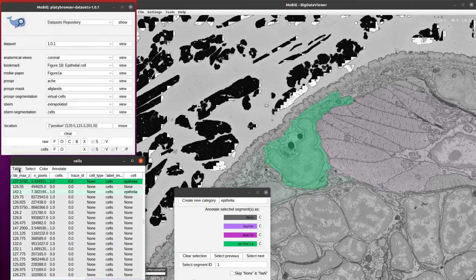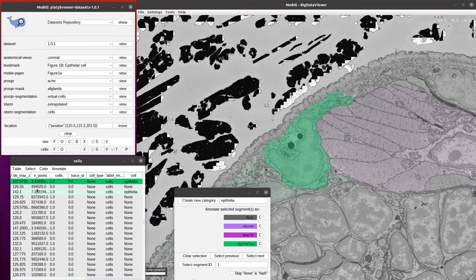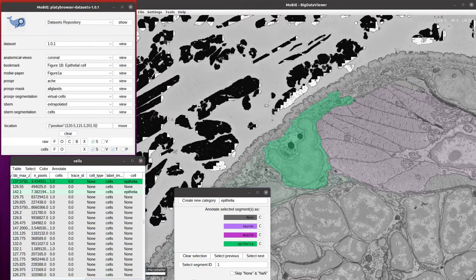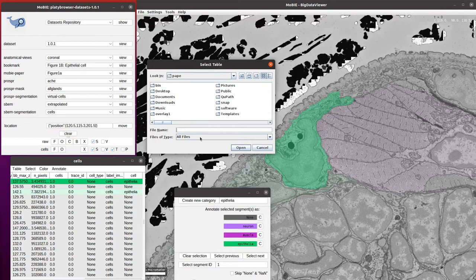Now, if at a later time you want to carry on that annotation, you can then load that into your column by going table, load columns, load from file system, and then navigating to that file that you just saved.